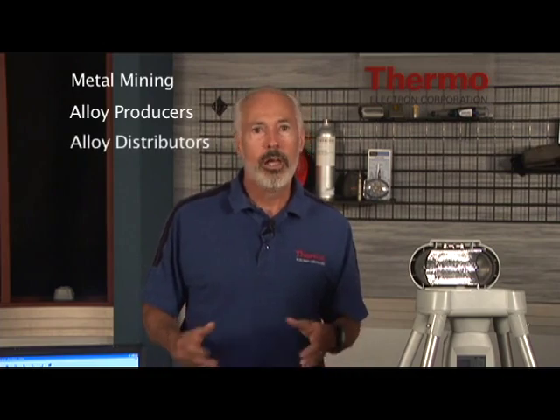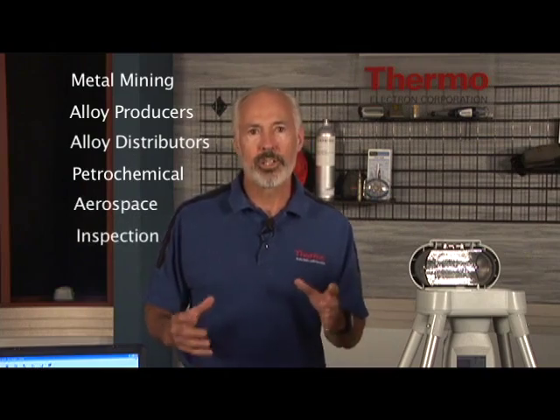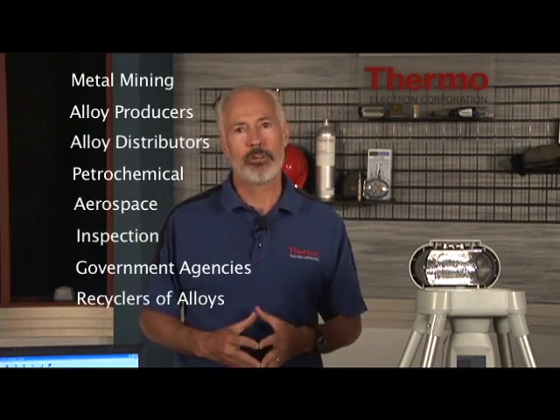The all-alloy or chemistry mode is used predominantly for alloy analysis applications. This mode is used by all types of industries for all types of metal alloy families that can be measured by Thermo-Electron's Niton Analyzer. Our alloy customers range from the metal mining industries to alloy producers to alloy distributors and to users such as petrochemical and aerospace companies, inspection companies, government agencies, and ultimately to the end-of-life recyclers of alloys. We're going to show you measurements of several alloy examples that cover each of these categories.